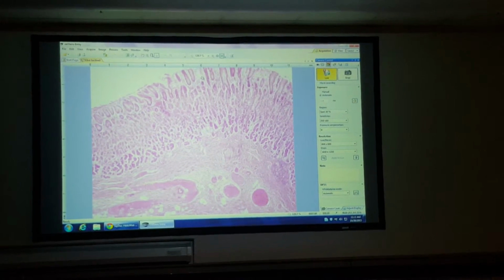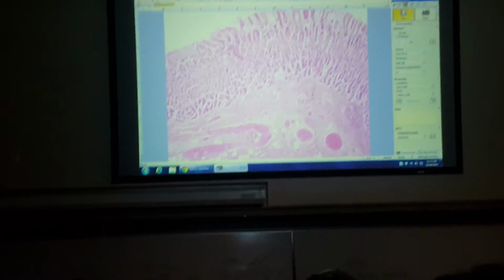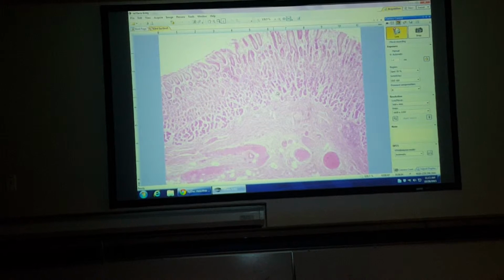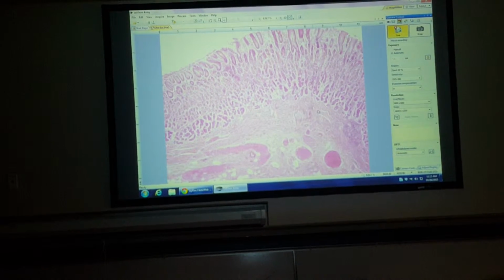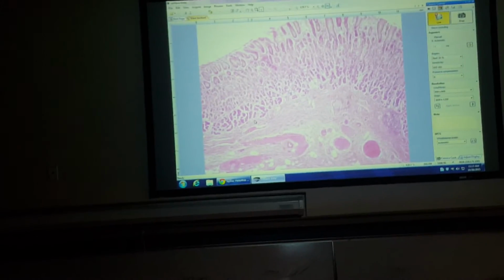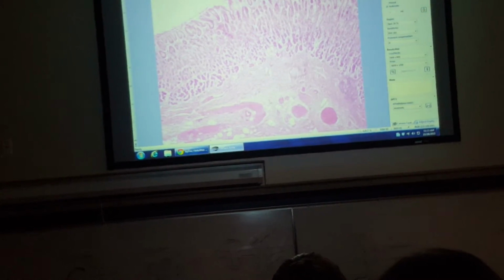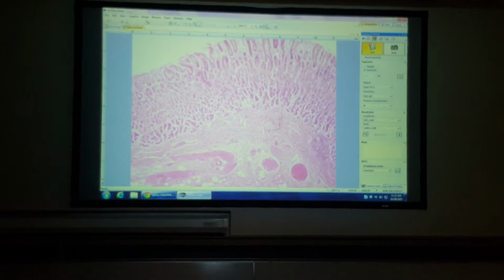What about if I pointed out here and said, name this layer? Lamina propria. Same thing if I pointed over here. That's still lamina propria, except between the glands. Yeah? Then what I'm seeing kind of loosens up through here where I don't see it as well. But right through here, from about here to here, it's a little denser. And then I see a change from there down. Everybody see that? That there's a little change in the tissue right along through here.